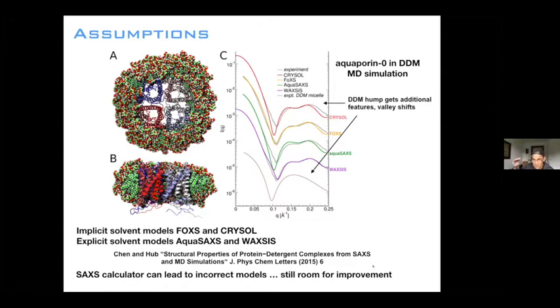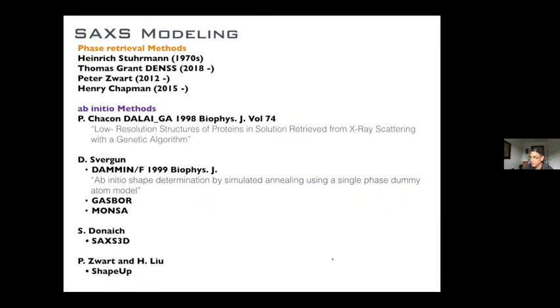So fundamentally, once you do your fitting, you really have to think about, if you're doing atomistic modeling, how can I test that model, right? What's an independent way for me to validate that model? Okay, so we'll see more of this in a bit.